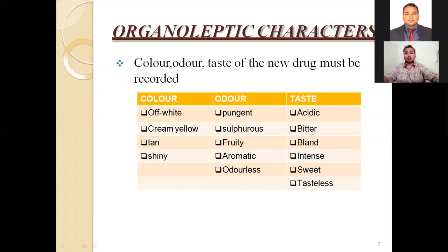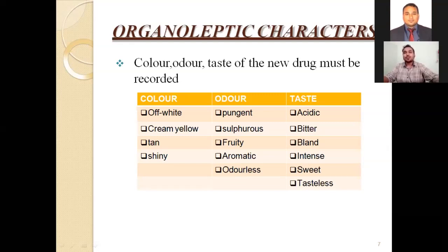Next, odor. By smelling, we can identify what kind of odor that particular tablet has — it may be pungent, sulfurous, fruity, aromatic, or odorless. Next, taste. Taste is mainly acidic, bitter, bland, intense, sweet, or tasteless. These are the main characteristics of organoleptic properties that we have to determine.